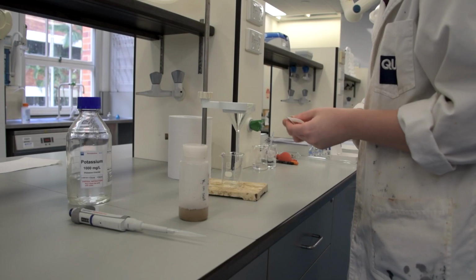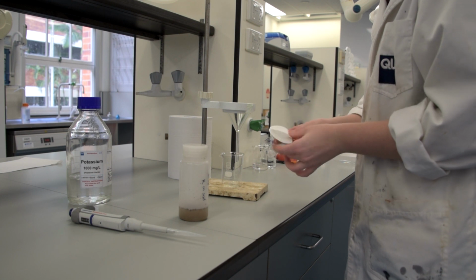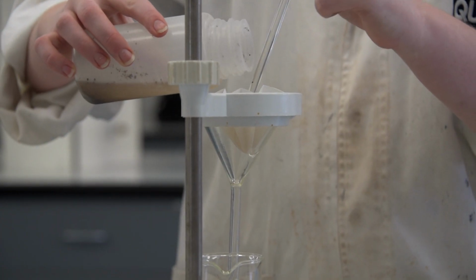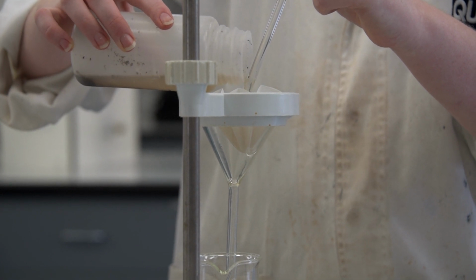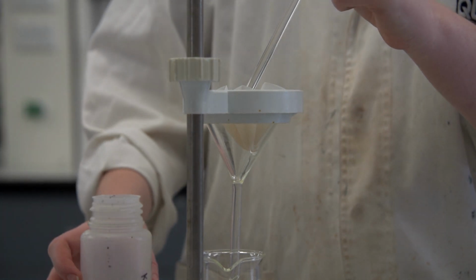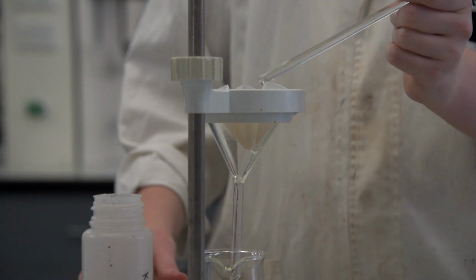Once the extraction was complete, a filtration apparatus was set up using a fluted filter paper. The solution from the soil extract was filtered using this apparatus into a beaker. The analyst in this case carefully decanted the solution to avoid tipping too many solids onto the filter paper.